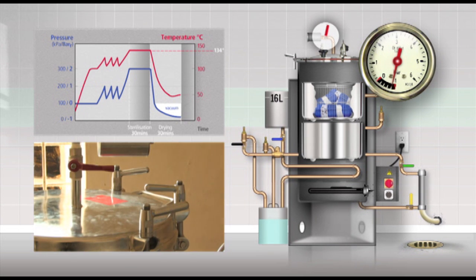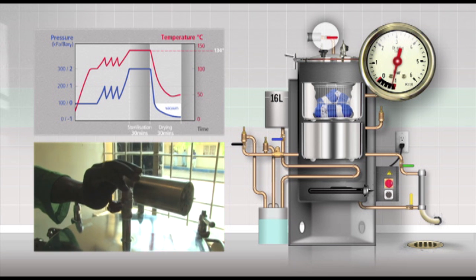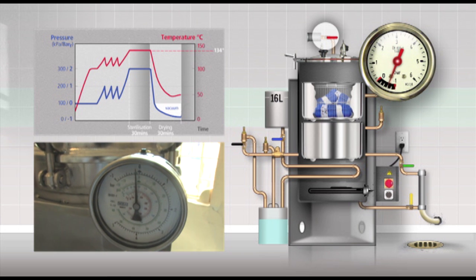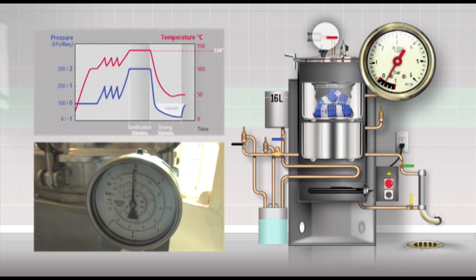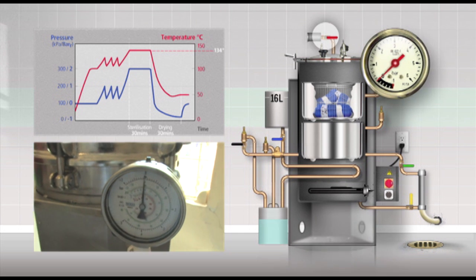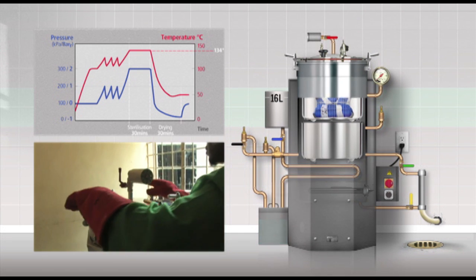Now open the red valve on top of the lid, the air admission valve. Air will enter the chamber and the pressure will increase to atmospheric pressure. The pressure gauge should show 0 bar.